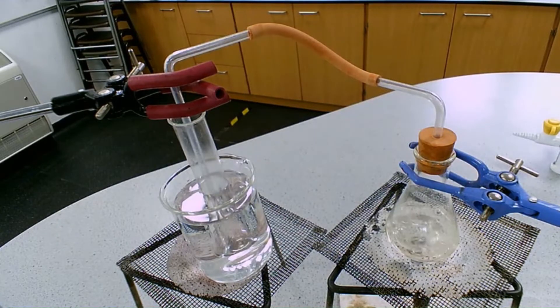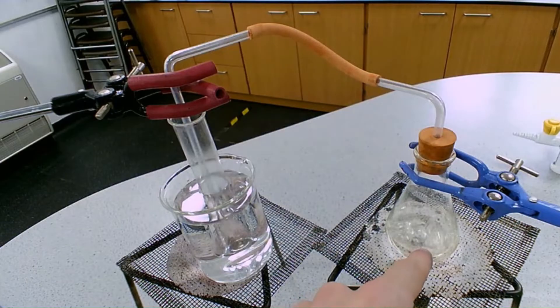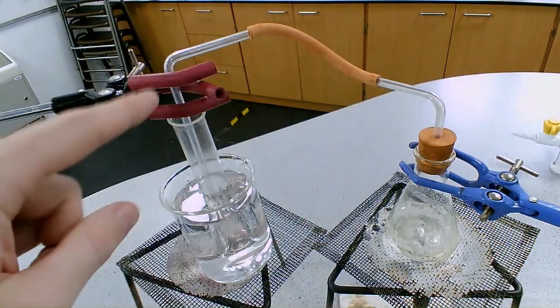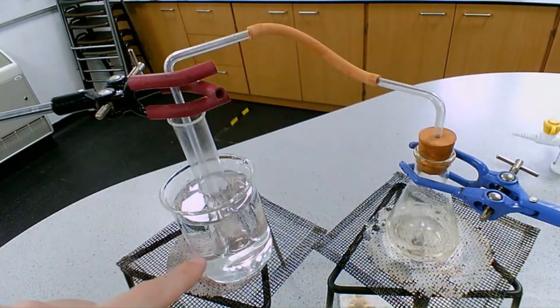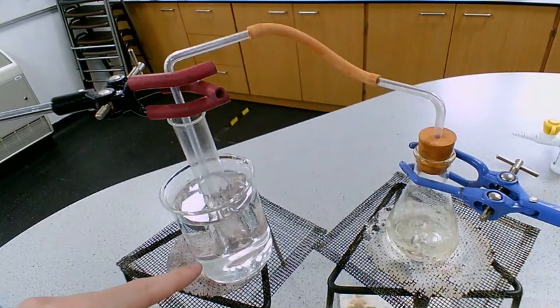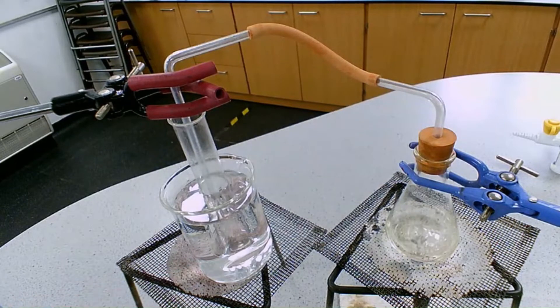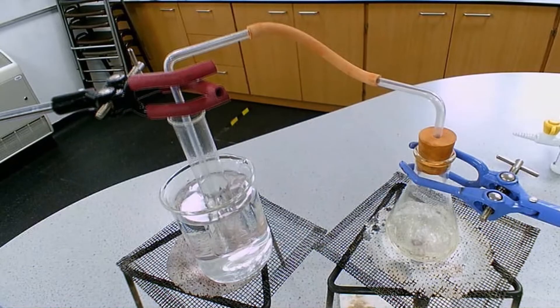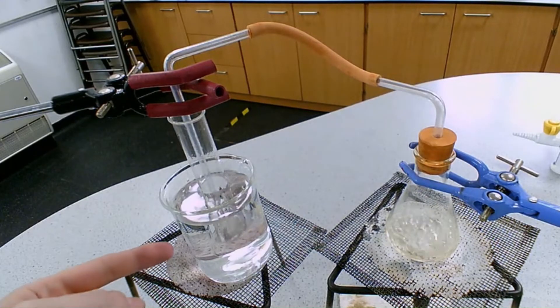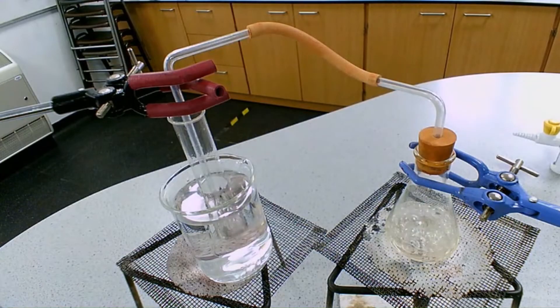After heating for a little bit, we can see the water is clearly boiling and evaporating, and we can start to see that the water vapor is condensing in the boiling tube and collecting at the bottom — so we're collecting our distillate, our distilled water, in the boiling tube. Once you've collected enough of your distillate, it is now time to turn off the gas.